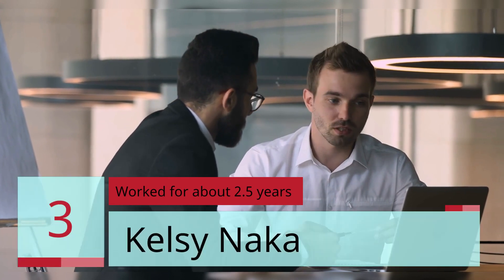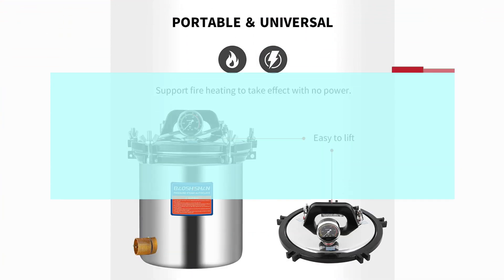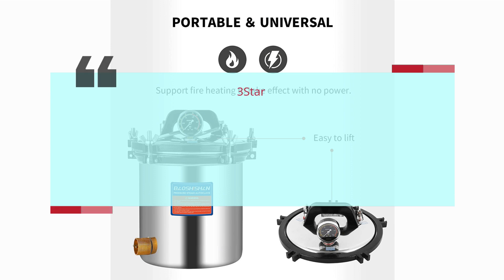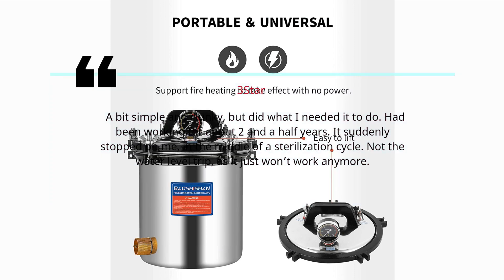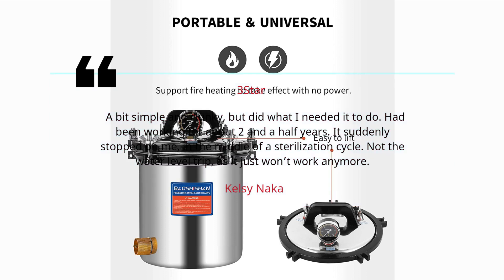Review 3: 'Worked for about 2.5 years' — Kelsey Naka, 3 Stars. A bit simple and clunky, but did what I needed it to do. Had been working for about two and a half years when it suddenly stopped on me in the middle of a sterilization cycle. Not the water level trip — it just won't work anymore.